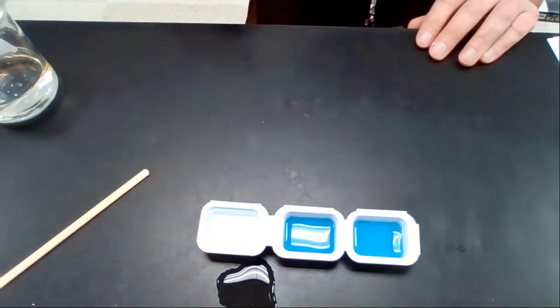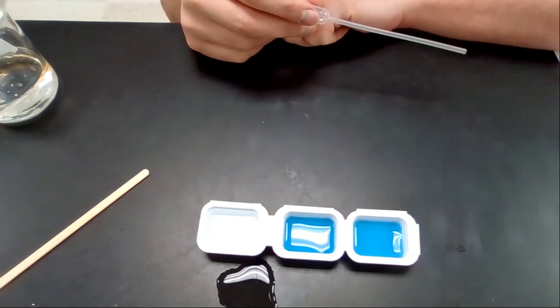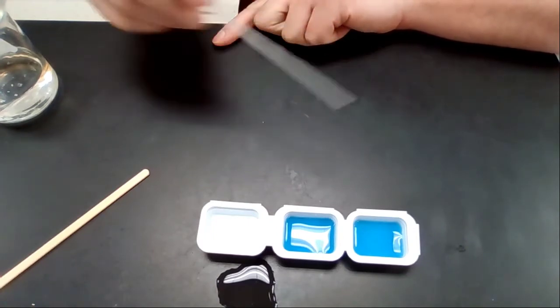All right, and we are going to take our pipette, and it says here on step number 9, stress 1, fill a pipette with vinegar from well 3 of the reaction tray, and add roughly half the pipette's content to well 1 and stir quickly with the pipette. And you're going to record your results in data table 3 for stress 1.